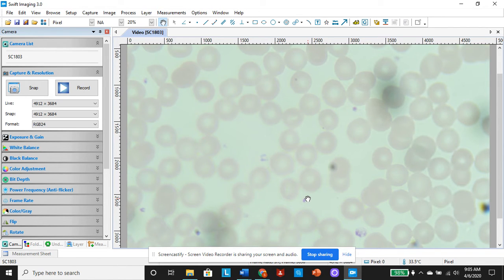I did not just spill my immersion oil. We won't talk about it.